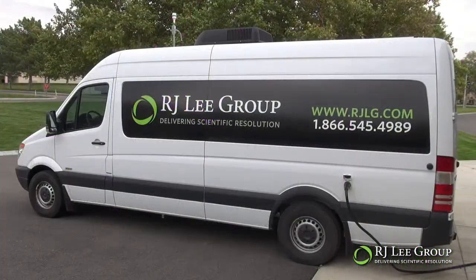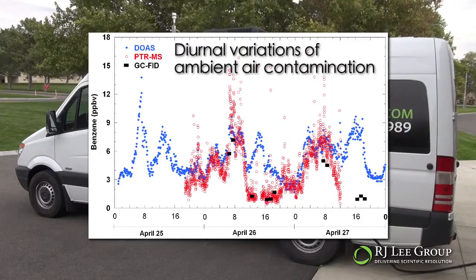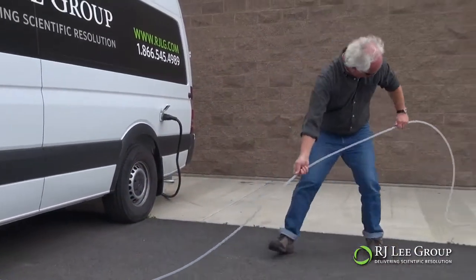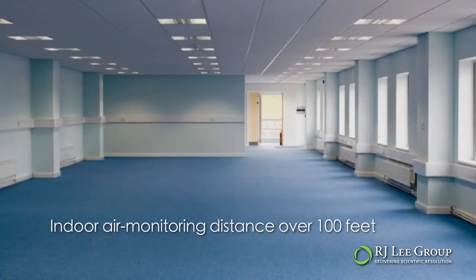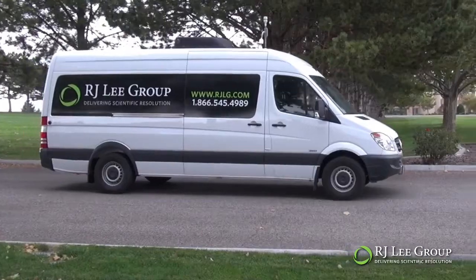While stationary, the mobile lab can measure variations in ambient air contamination within 24 hours. And with a flexible, lightweight sampling tube, the mobile laboratory can measure VOC concentrations in indoor environments at a distance of over 100 feet without any loss of monitoring sensitivity.